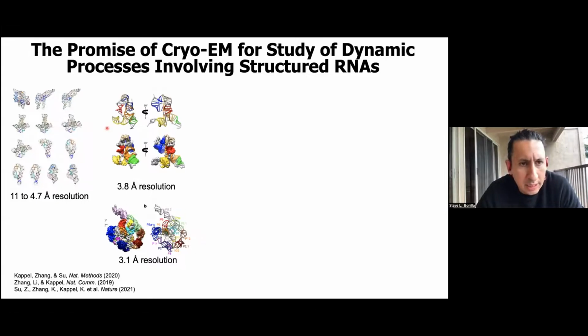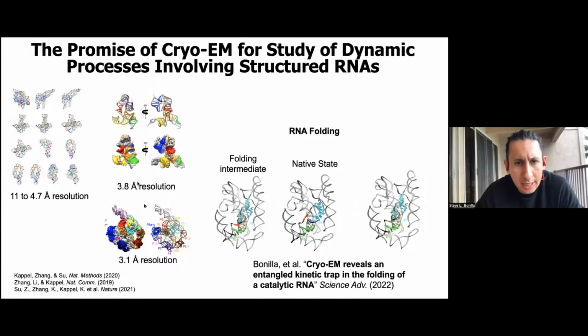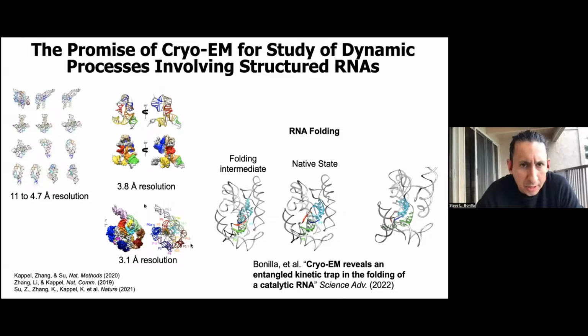Sorry, I forgot to update this slide, but there are many new developments in RNA structure by Cryo-EM. I hope that I also convinced you that even at low resolution, we're starting to get some qualitative information about the conformational dynamics undergone by RNA, and we are even starting to get information about dynamic processes such as RNA folding.